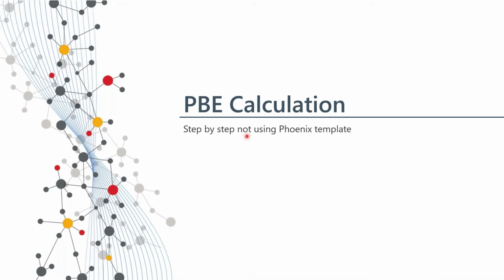In practice, how can we make the PBE calculation? You will see later, at the end of this talk, that Mouli is going to present a template. I am going to present another template here, which was made more to explain step by step all the calculation.